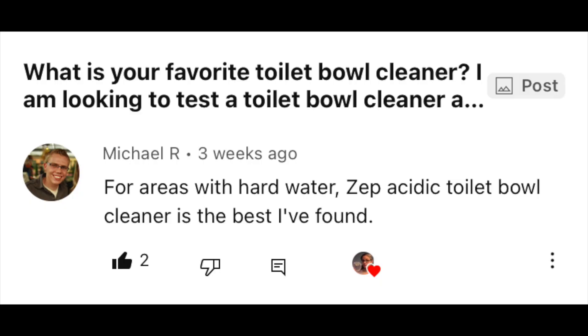Hi everybody. Today's focus, I'm testing Zep Acidic Toilet Bowl Cleaner to see if it can remove bacteria from my toilet bowl. A little while ago I created a community post where I asked my viewers what toilet bowl cleaner do they use, and one of my longtime supporters, Michael, had suggested I try Zep. So that's what we're gonna test today.